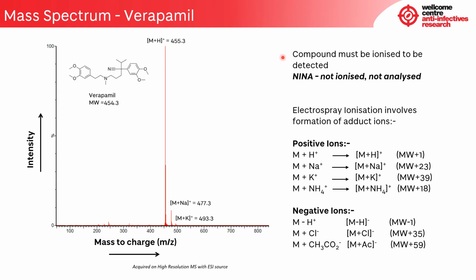Perhaps the key point to note from the spectrum is that the compound must be ionized to be detected. This is summed up by the acronym NINA: if it's not ionized, it's not analyzed.